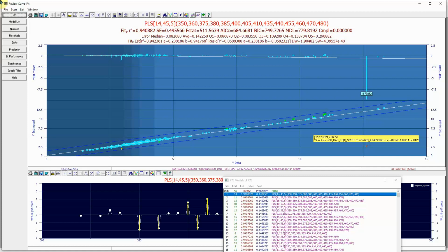It's way beyond 3 standard errors. It's why it is colored red. We also see one yellow colored spectral data set. This value is outside 2 standard errors but not beyond 3. This yellow point is also outside a 95% default linear Y versus X prediction interval. This is the blue band you see around the prediction curve.